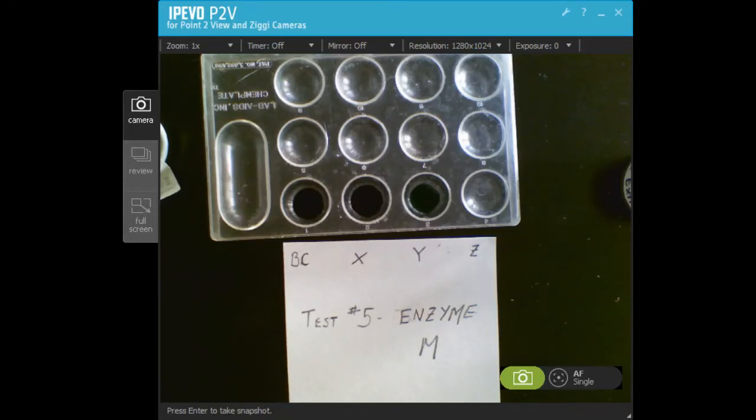Hey everyone, in this video I am going to complete test number five for the New York State relationships and biodiversity lab. Test number five is going to test for the presence of enzyme M in each of the four plant species: Botanicuris, species X, Y, and Z.